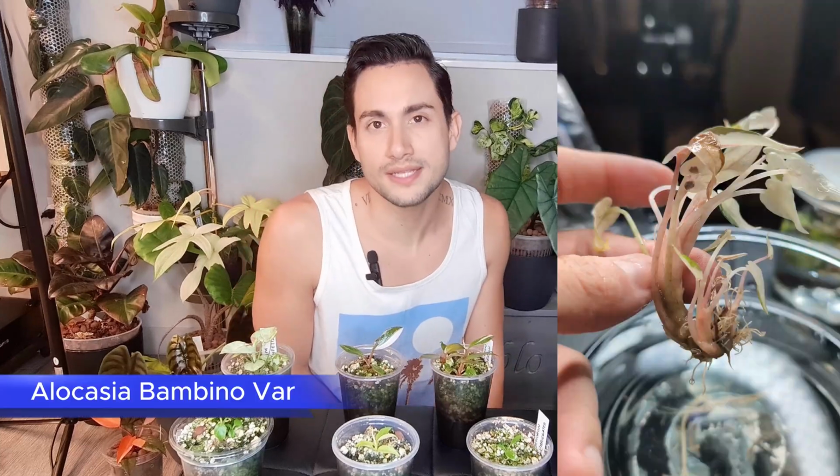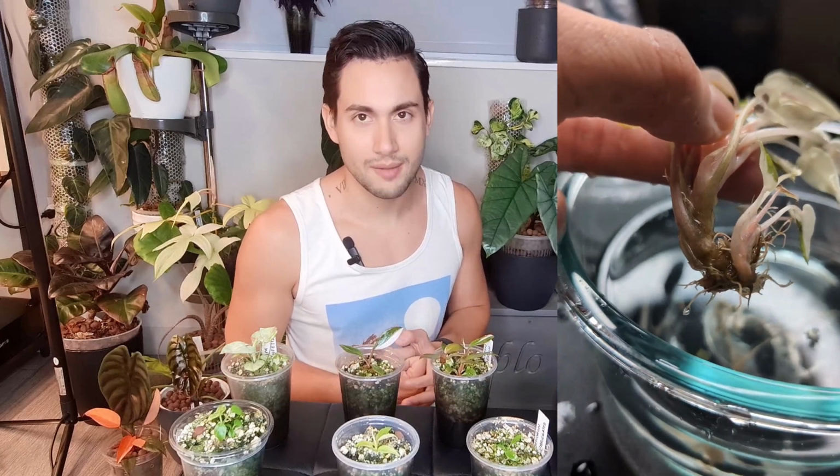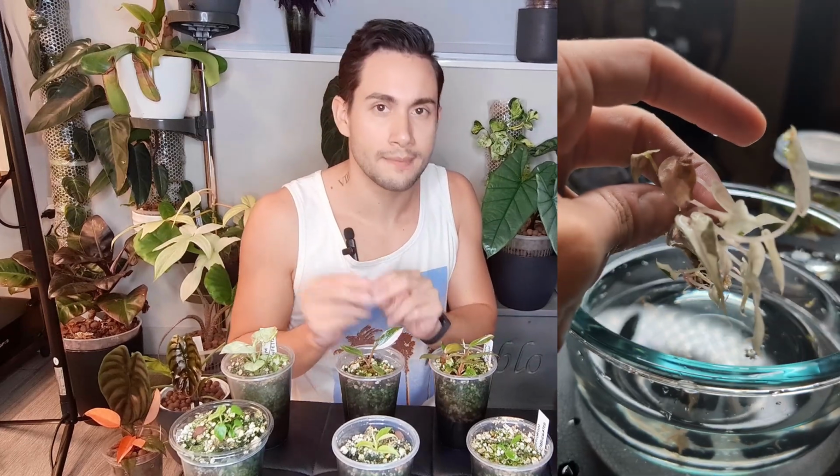Now let's talk about those plants that did not make it. I had a few casualties. Unfortunately, they were plants that I really wanted. The first one was the Alocasia pink Bambino. You can see the video that I took when I was deflasking it, and you can see how pink it was. The moment I realized how pink it was, my heart dropped, and I was like, oh no, this plant has no chlorophyll. It's barely hanging on by a couple of older leaves, but all of the new growth was full pink, and it had a few little offshoots that had a little bit of green that I had some hopes for. Unfortunately, that plant also completely melted.